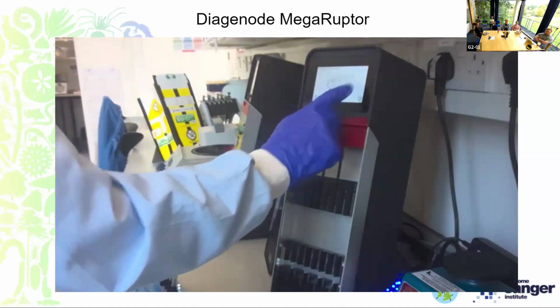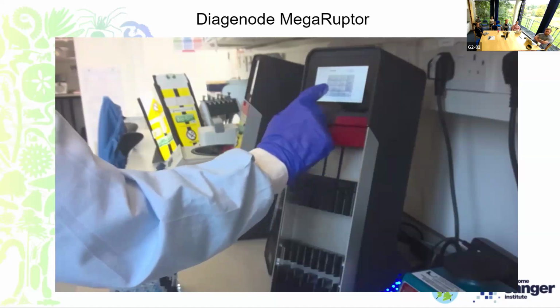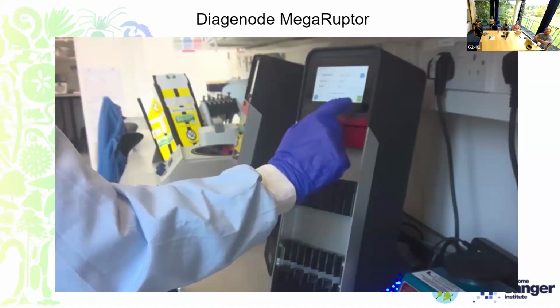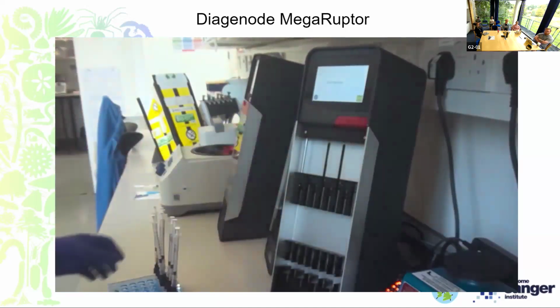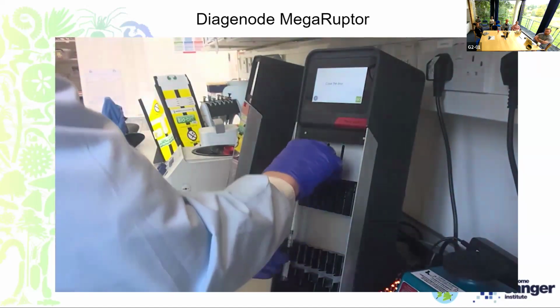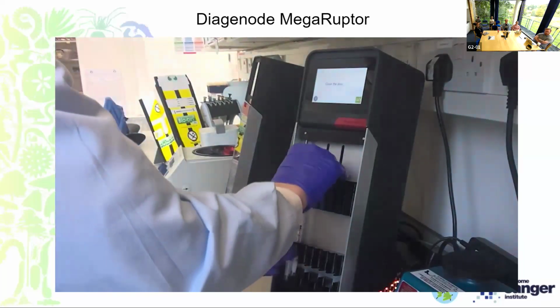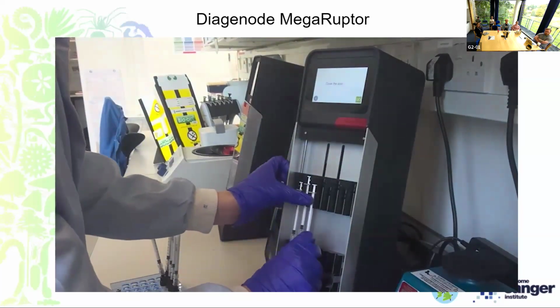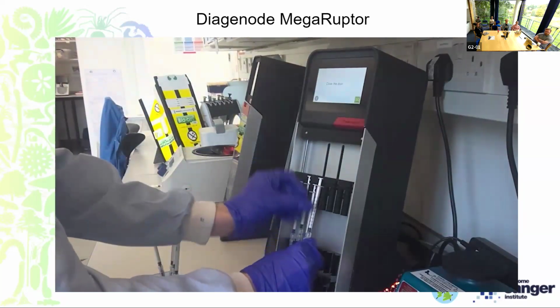Then we choose our settings. You can set the concentration of your samples, the volume of your sample, and how quickly you want it to run. We have a setting of 31 for our samples, and that should give us the insert size for PacBio HiFi of between 12 and 20,000 bases. Samples are then loaded into the instrument. They clip into place nice and firmly.